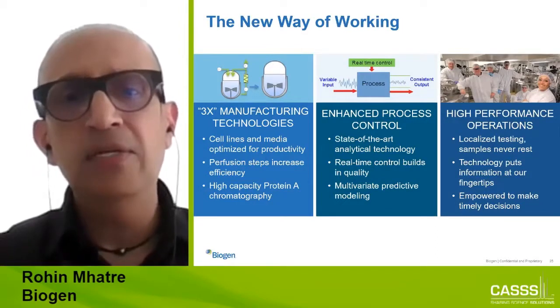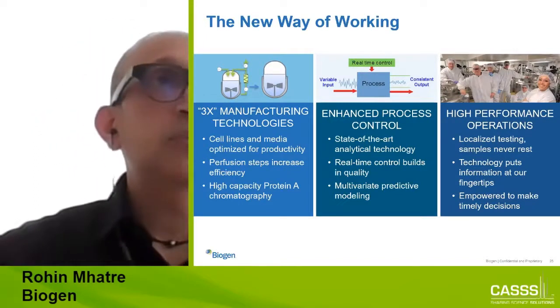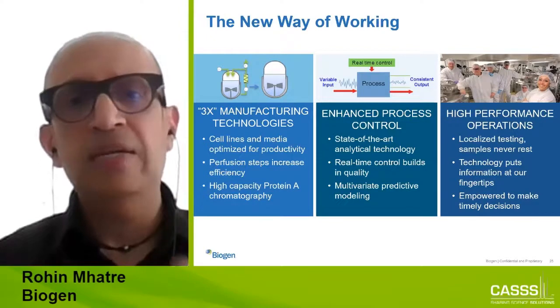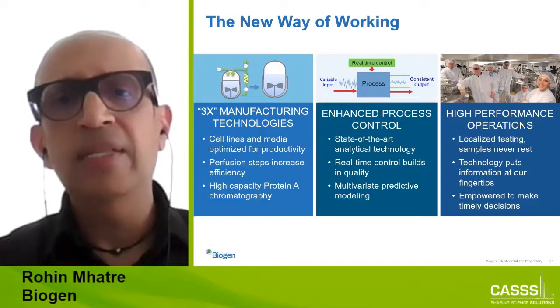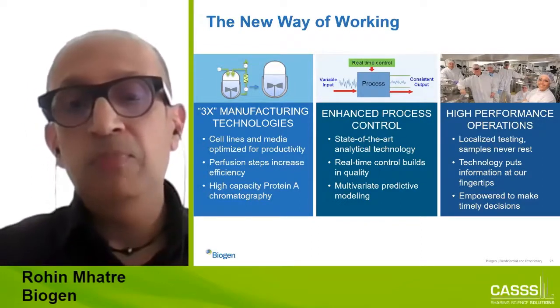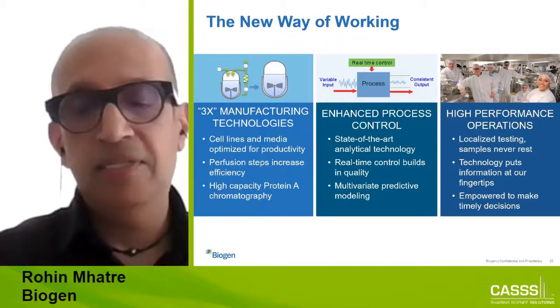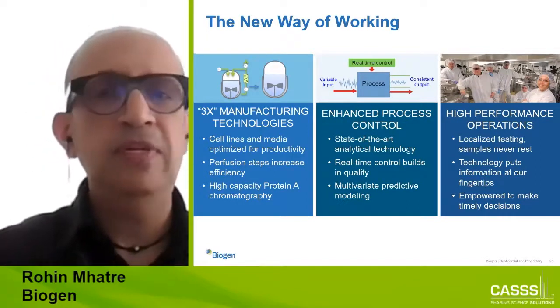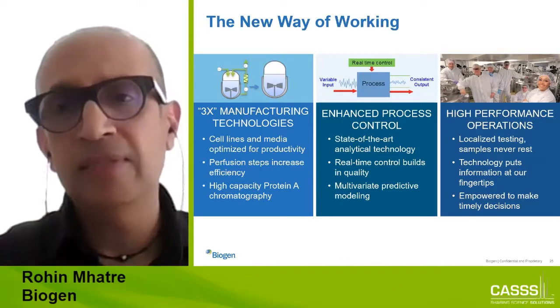We are going into, just based on our portfolio, very, very high productivity processes. The throughput to the facility is what we focus on, as I mentioned, through modeling and so on, putting in the right kind of controls in there, and not being so concerned about putting these tools on the floor. It's nothing. It's a detector to a large part, whether that be a mass spec, whether that be a UV or refractive index. And if it gives you the right information, we're willing to do that.